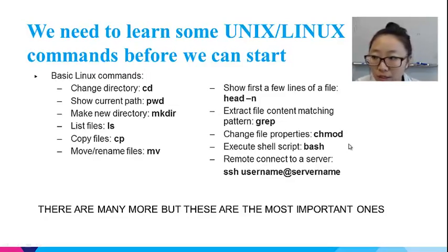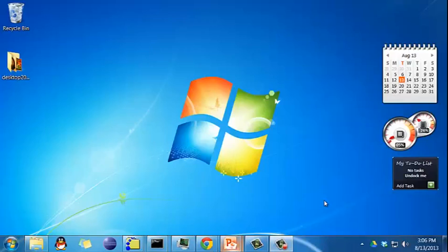The commands will be demoed in the Linux system. For Mac users, simply open the terminal and the commands will do exactly the same as shown in the lecture. For Windows users, since the default command prompt is not Linux-based, we need to mimic the Linux environment with the software Cygwin. I've written step-by-step instructions about how to install Cygwin in Windows. You can find it in the assignment for this lecture.